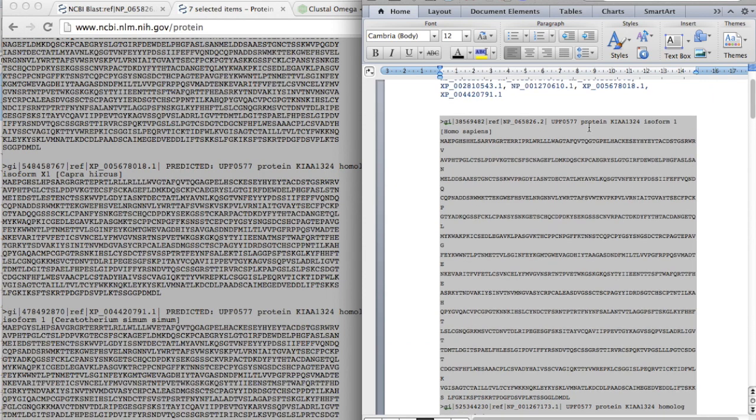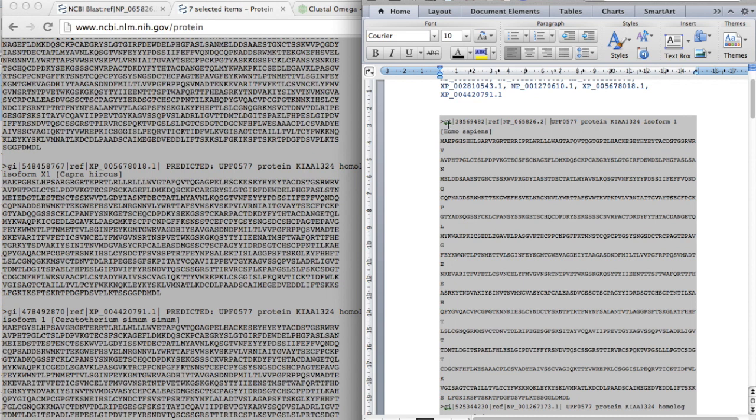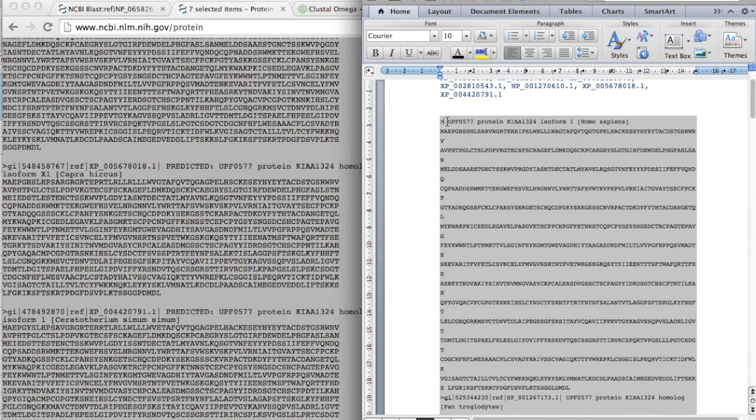And you can edit this. You can actually remove this and just replace it with Homo sapiens.